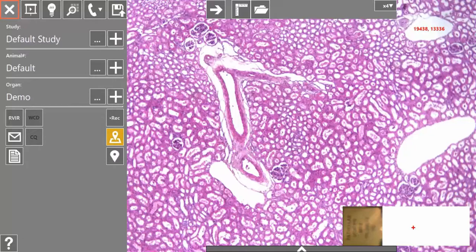Doesn't make a difference. Okay, so we are making a demo. It's a simple demo here. Right now in the corner you see different data.